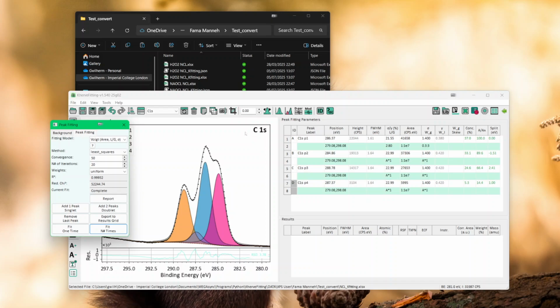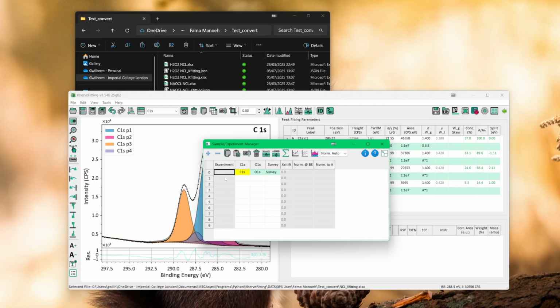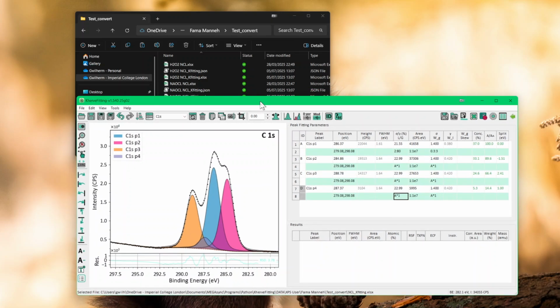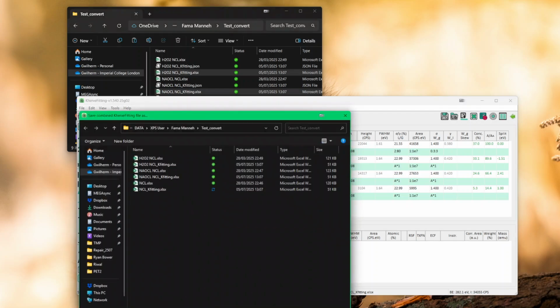Okay, so let's say now we want a multiple file, because right now in our sample manager, and let me save that quickly, in our sample manager, we get only one file, and there is no name here. So if we want to add them all together, then we would just take the KFitting files, like that. And you see we have 3 files shown on there. You add them, and you call it whatever you like. Let's say test.